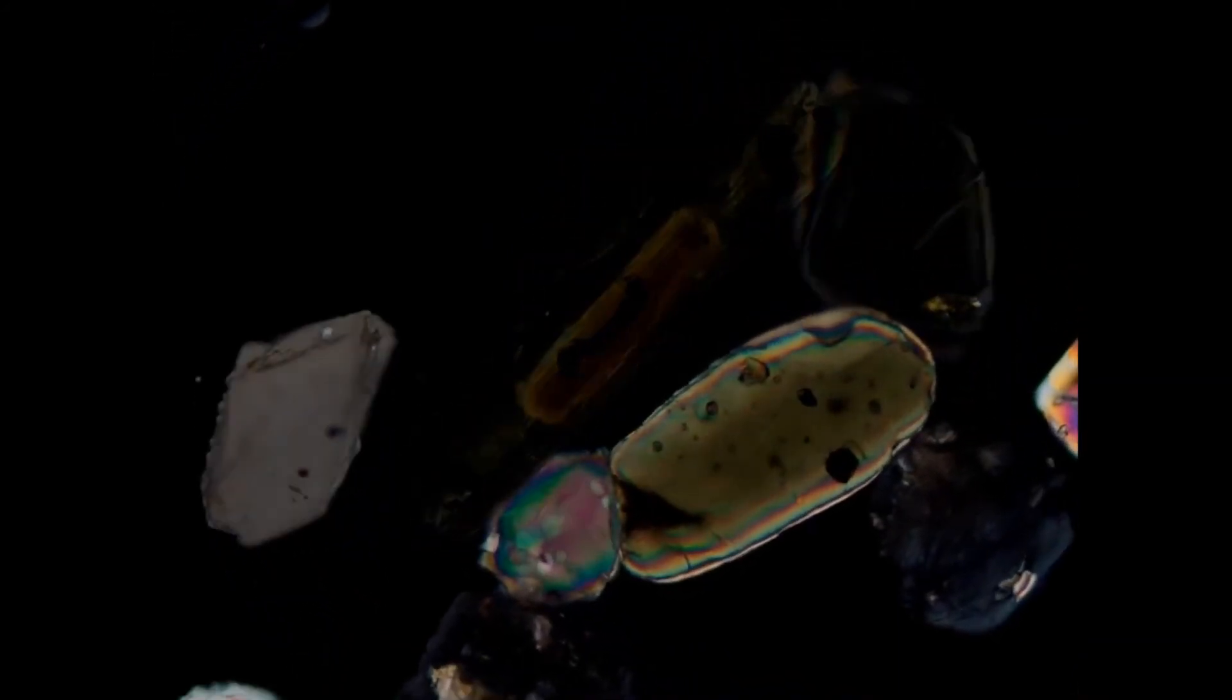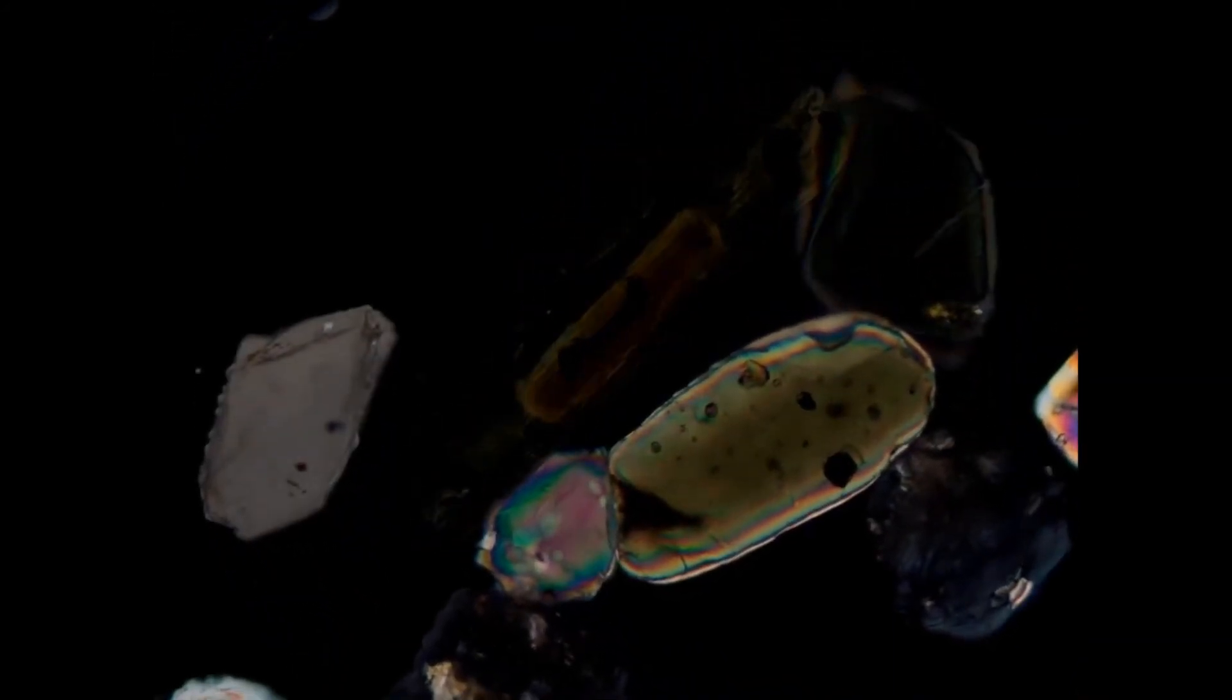We also see that these minerals are not extinct when oriented north-south, which means that they have inclined extinction. In this case here, the extinction angle is around 35 degrees, which is rather large.